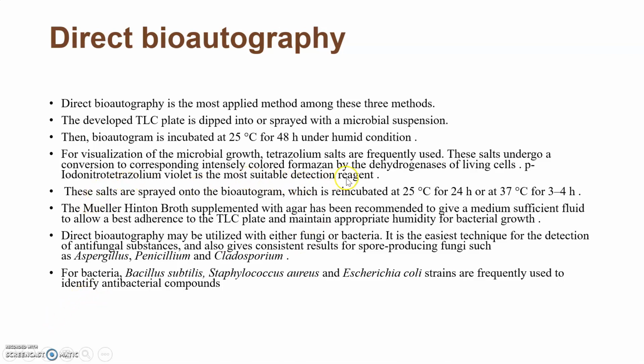Para-iodo-nitro-tetrazolium violet is the most usable detection reagent. These salts are sprayed on the bioautogram.